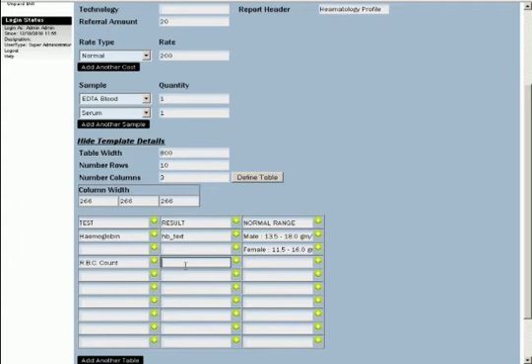Last, we define a normal range. This normal range is not used to define the limits of the parameter, but simply to show the normal ranges to the person in the report. As you can see, when we want 2 rows of normal ranges, we are using the next row to define it. Once all the values are entered, we can then define the formulas and other details.